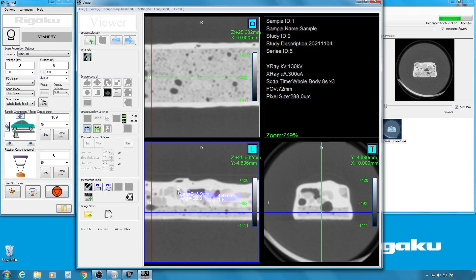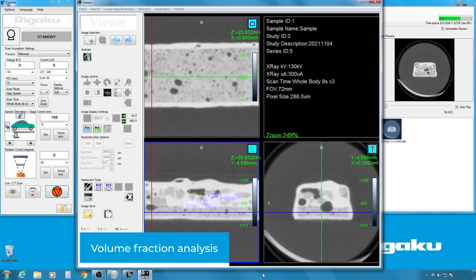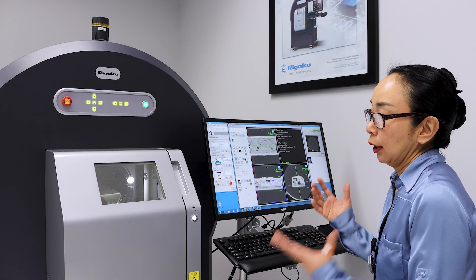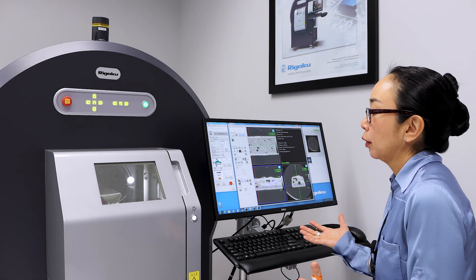You can do the same thing with those peanuts, for example. You can also do a volume of fraction analysis or size of distribution analysis.